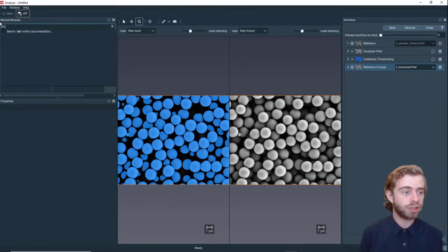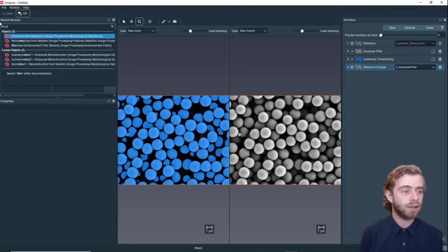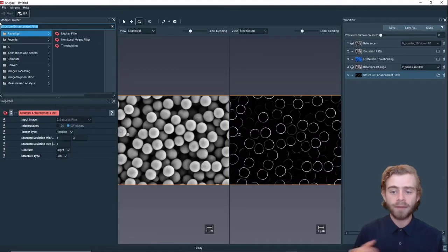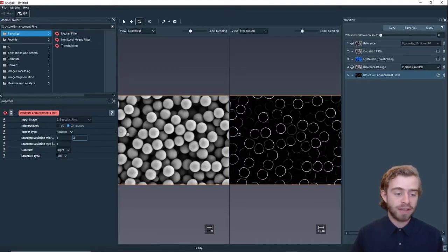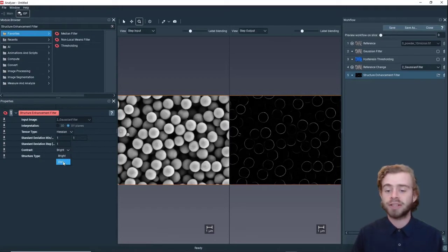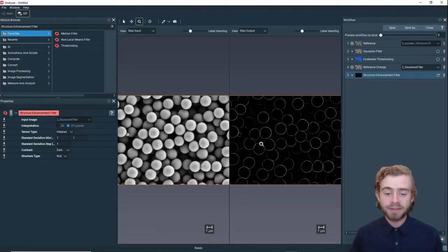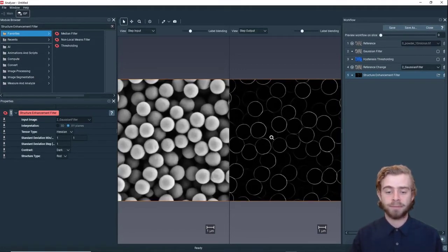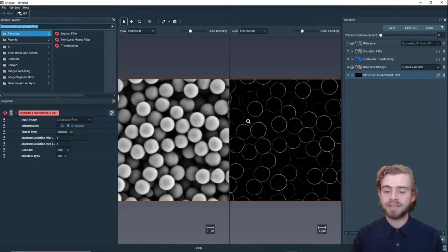The next thing we want to do is use a Structure Enhancement Filter. We're going to change the standard deviation to 1 and change the contrast to Dark. What this does is — as you can see — it has now created outlines of each of the powder particles.